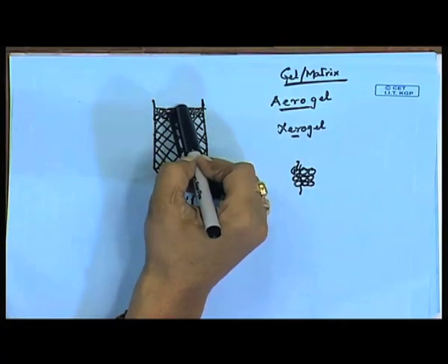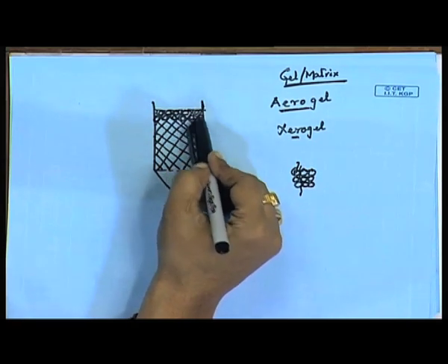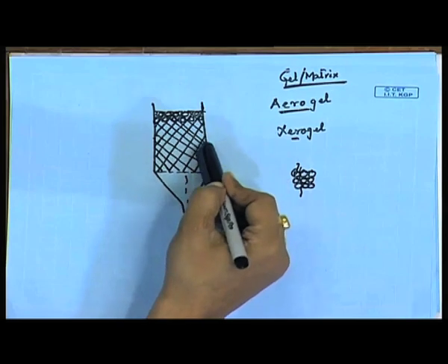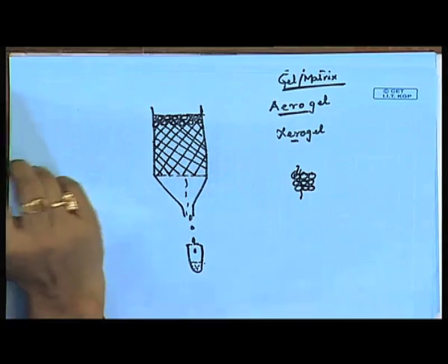Through these beads, from one bead to another, the filtration of the smallest molecule to the biggest molecules takes place, and it takes a longer time to cross the beads. They get sufficient time to arrange themselves within the column while moving from top to bottom, and then they are collected.